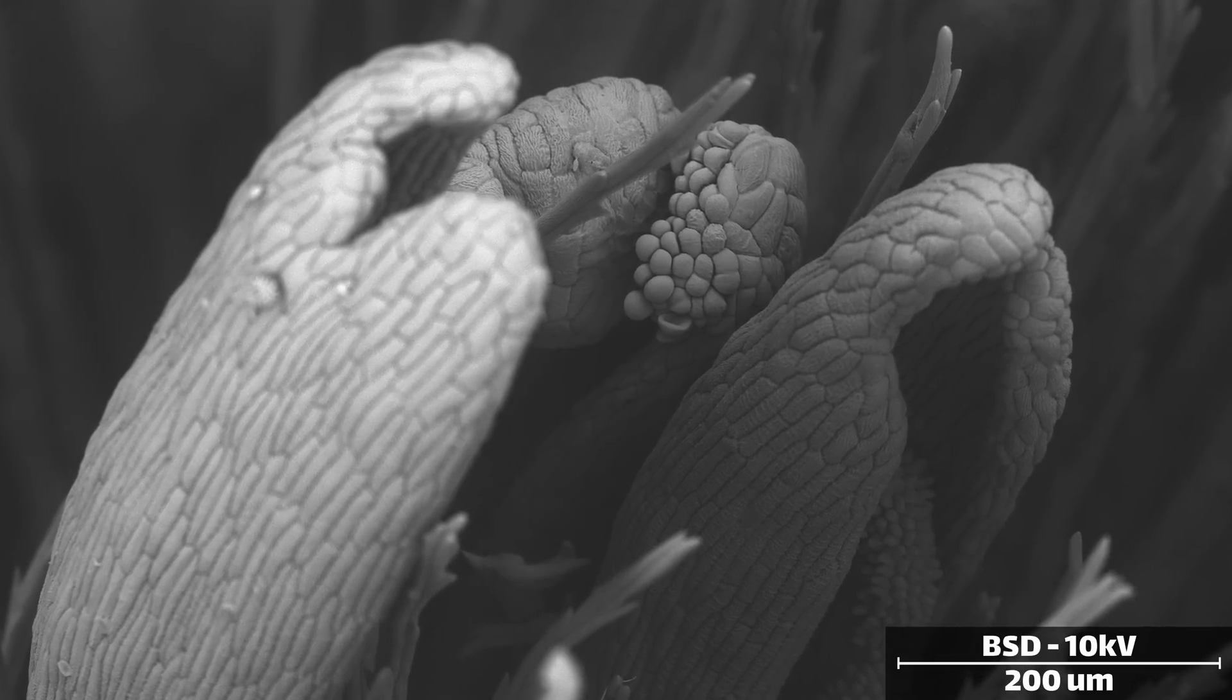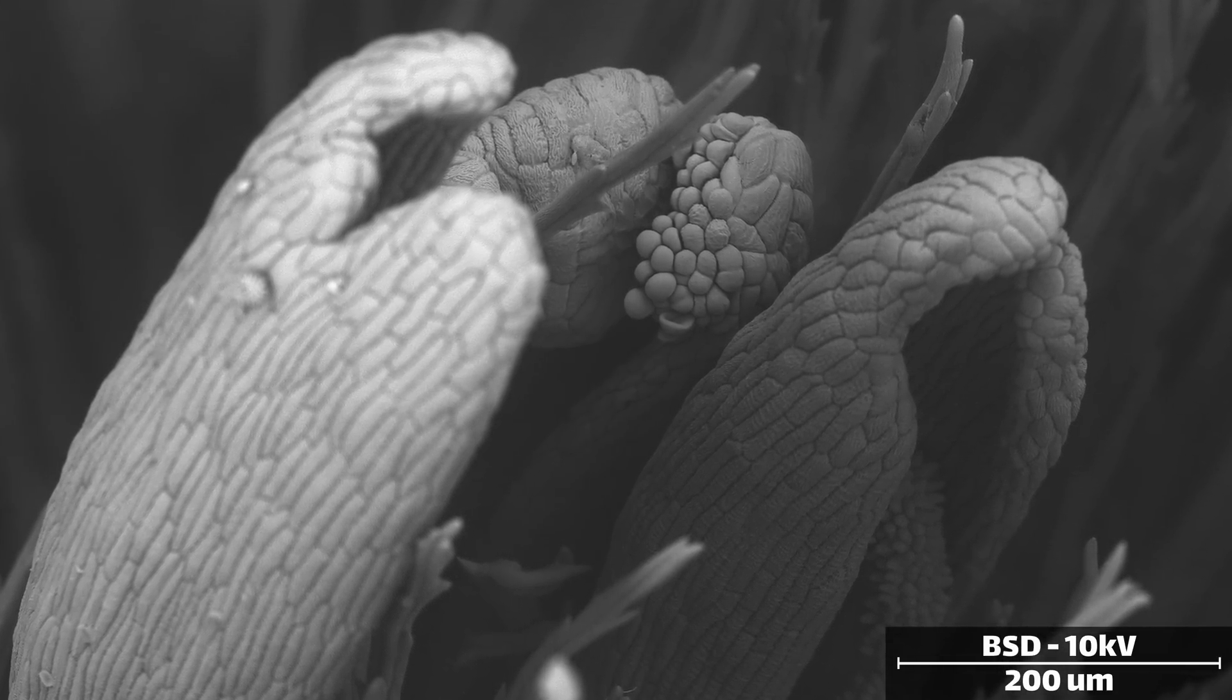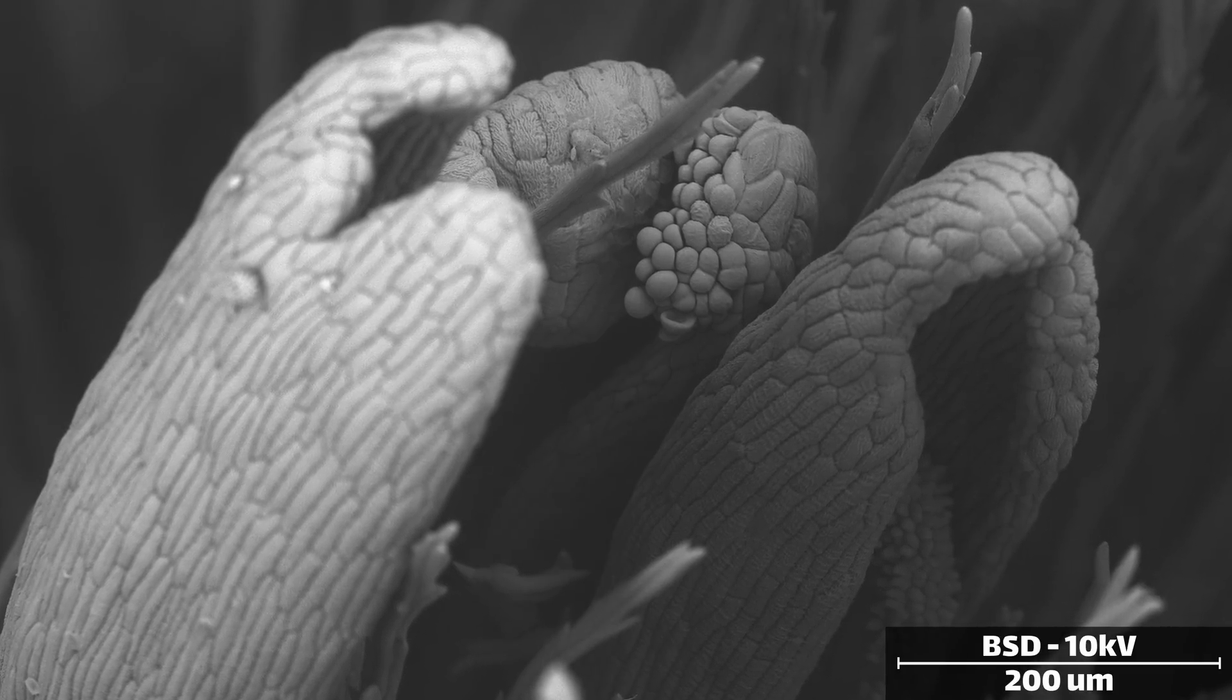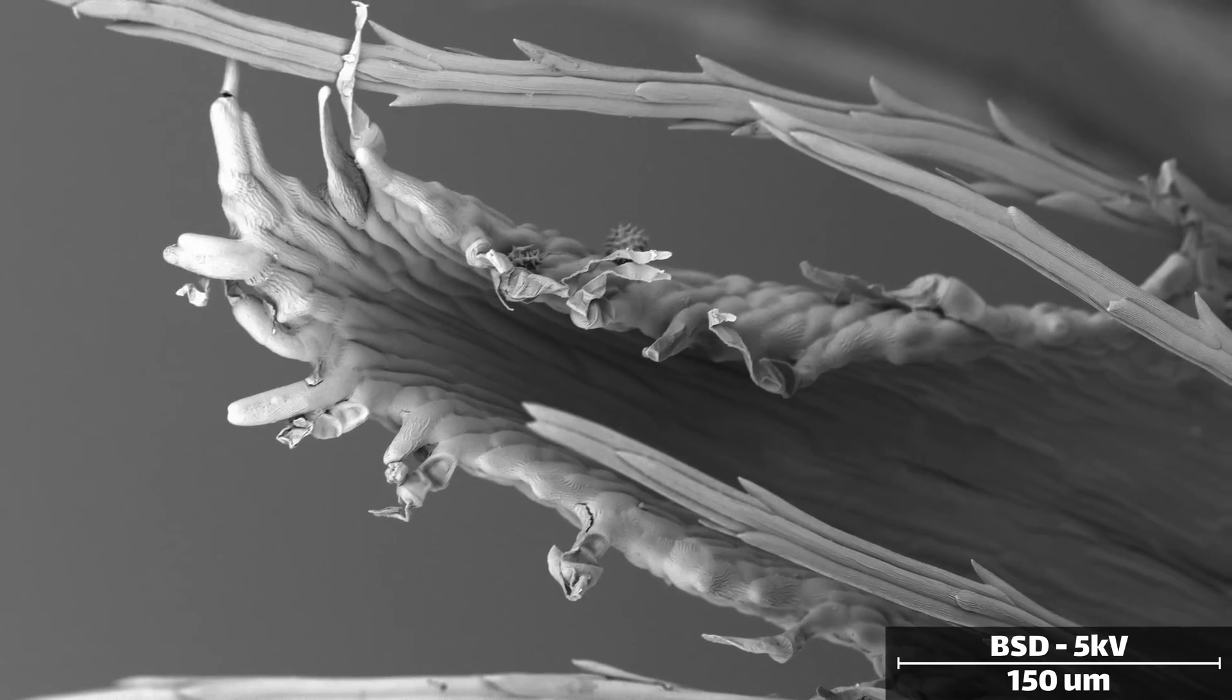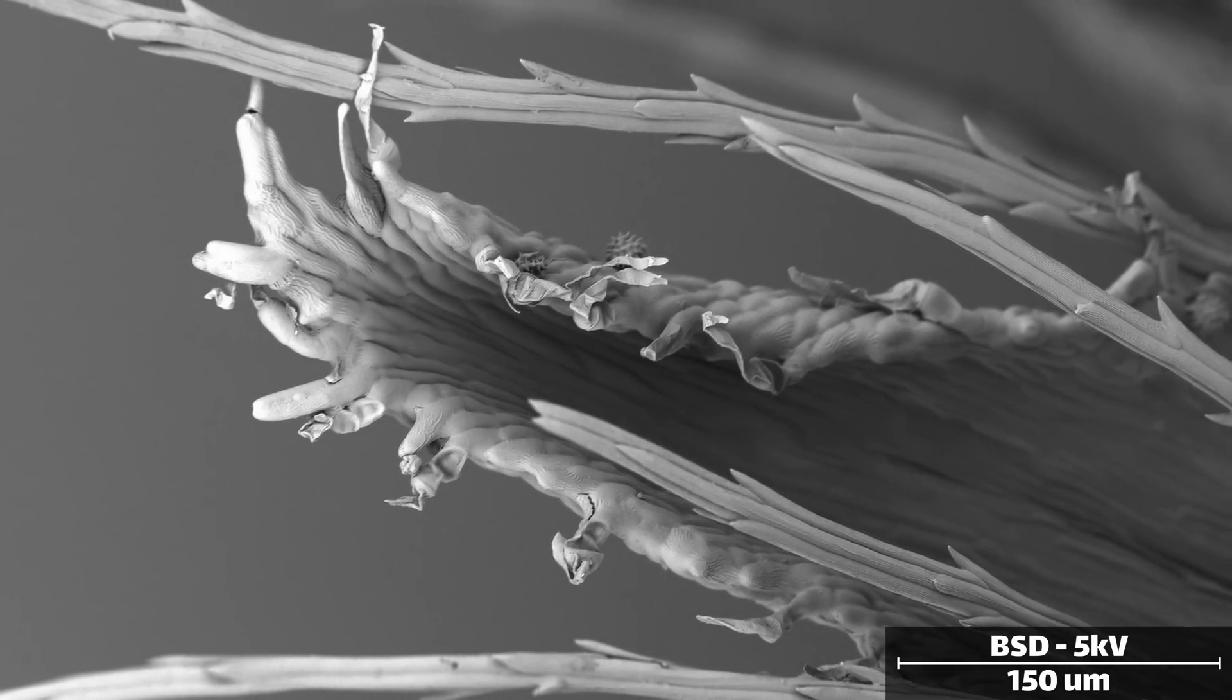So it's always important to remember that some features may not look exactly like they do in real life, and this applies to scientific papers just as much as YouTube videos. If there is interest in the logistics of preparing samples for microscopy, perhaps we can do a future video on that subject.